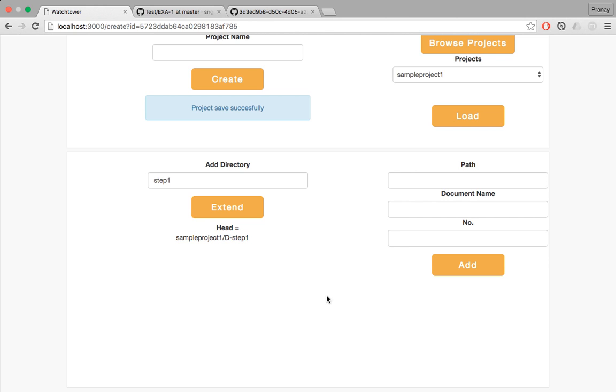Now, for this step, I'm working with a bunch of artifacts. Let's call them 5 test tubes. I'm working with 5 test tubes in this project. They can be anything for that matter, but just for the ease of example, I'm going to give 5 test tubes. So now I want to store observations for each of those 5 test tubes, right? Because I'm gonna do some experiments on them, they'll yield some results, and I want to observe these results. So I want 5 specific text files which I can relate to those 5 test tubes, right?